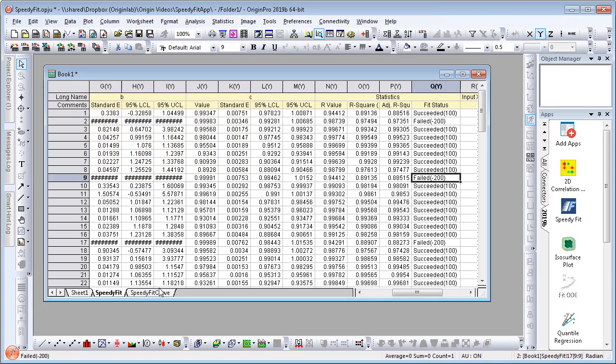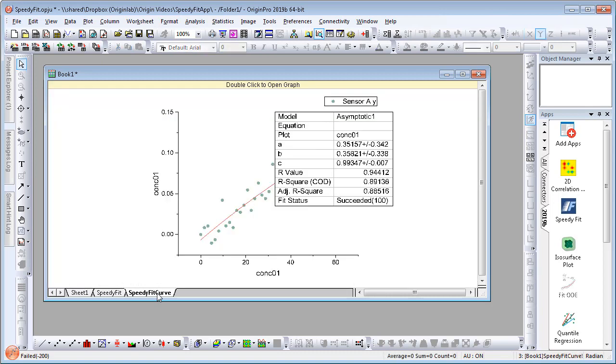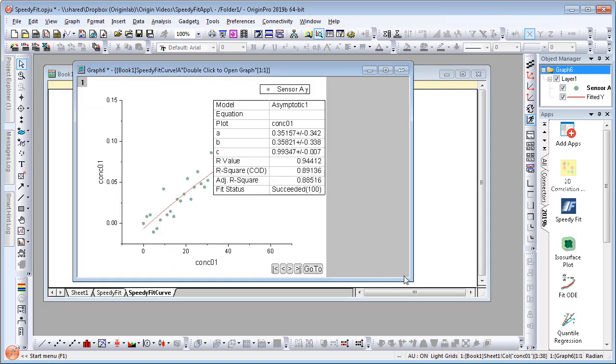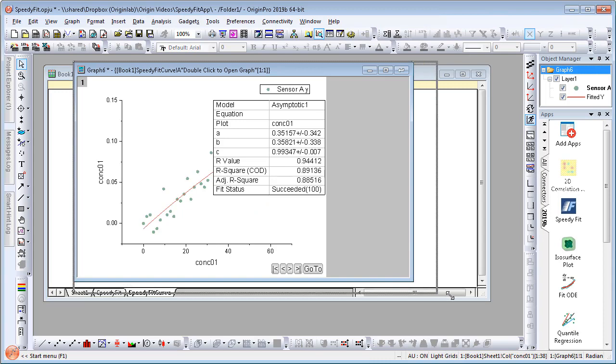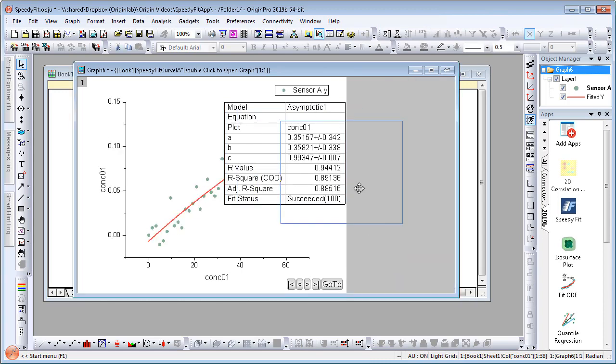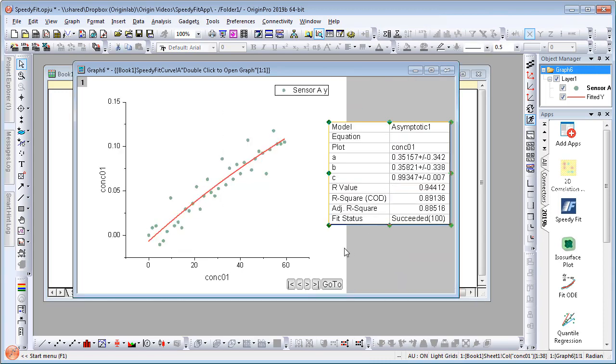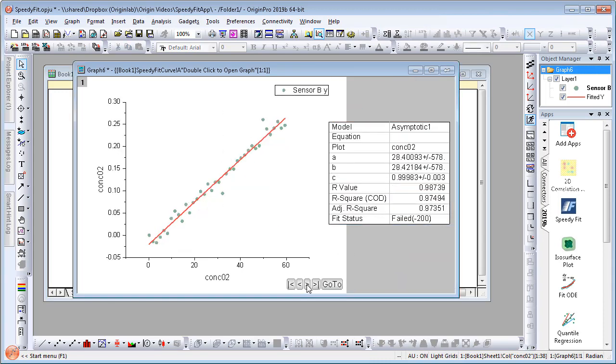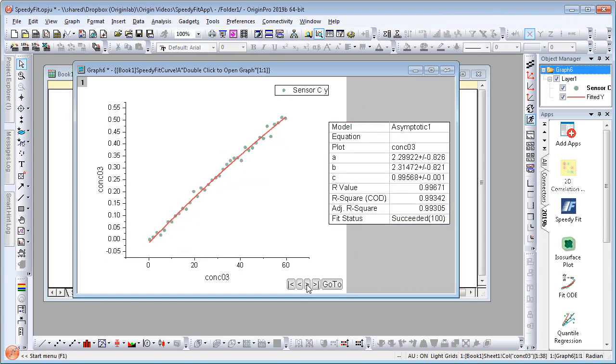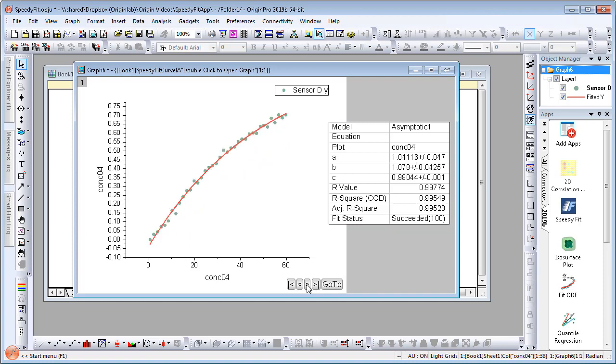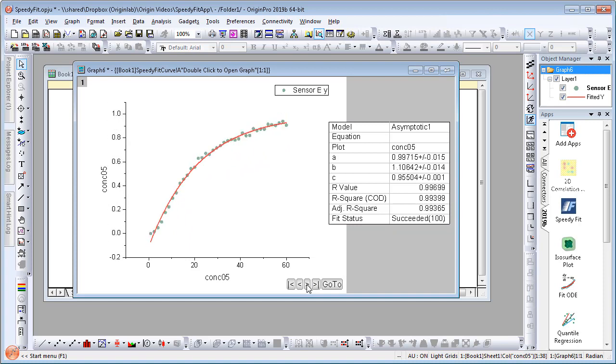Finally, there is another tab called Speedy Fit Curve. It contains an embedded graph along with arrow buttons to flip through each data set, allowing you to easily examine the fit status and other parameters.